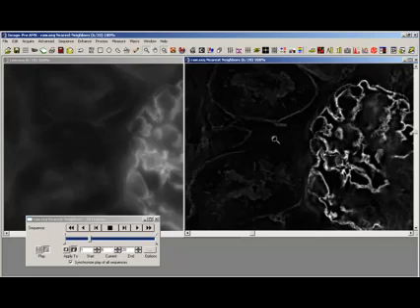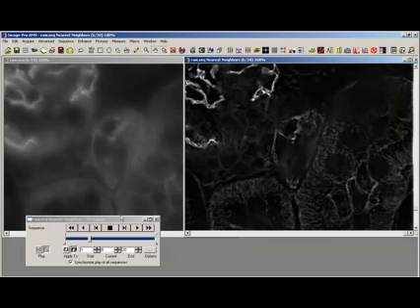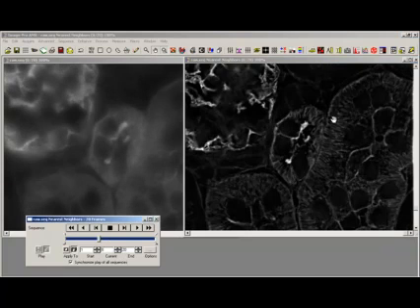And if I just zoom in, and we'll pan around, you can see that my final image here is actually giving me quite a lot more resolution. I'll just roll through the sequence so we can see there's quite a significant change between here and here. Deconvolution time takes about a second an image on a nearest neighbor, but that's dependent on your computer and processing power. This image can then be saved as a sequence or an AVI or even a series of TIFFs.